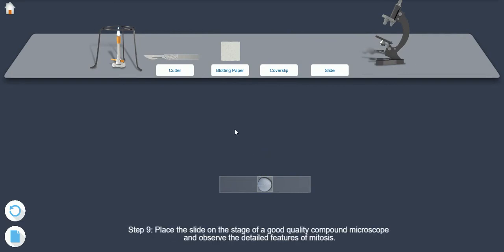Step 9. Place the slide on the stage of a good quality compound microscope and observe the detailed features of mitosis.